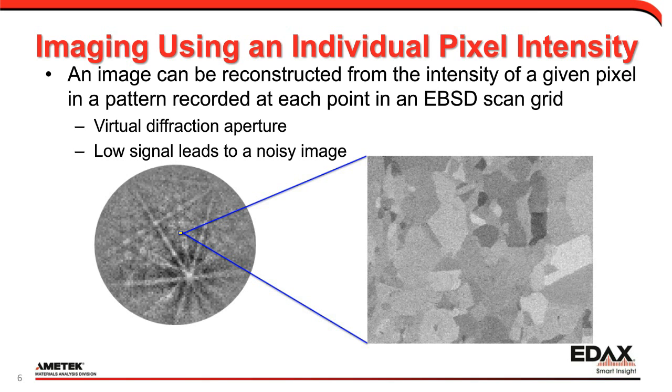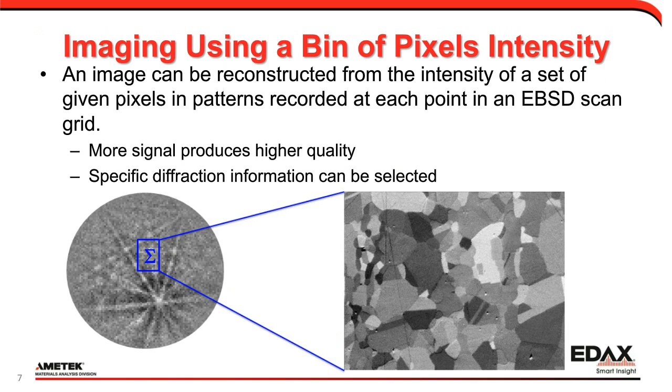Somewhere between these options is a selection of a virtual aperture of a finite size. It has the advantages of high signal, low noise, reasonable contrast, and ease and number of selection. This is the general direction in which the software was developed. To make the location selection slightly more reasonable and reproducible for most users, we have included a number of predefined aperture options.